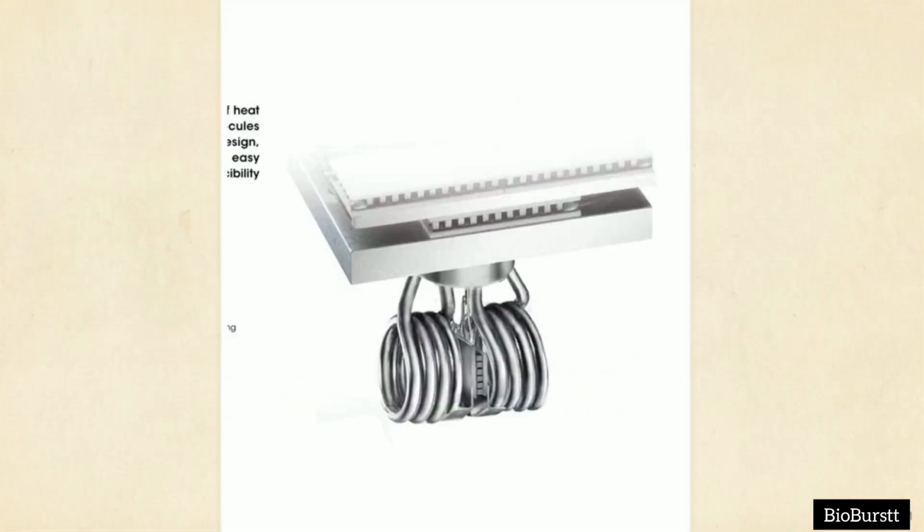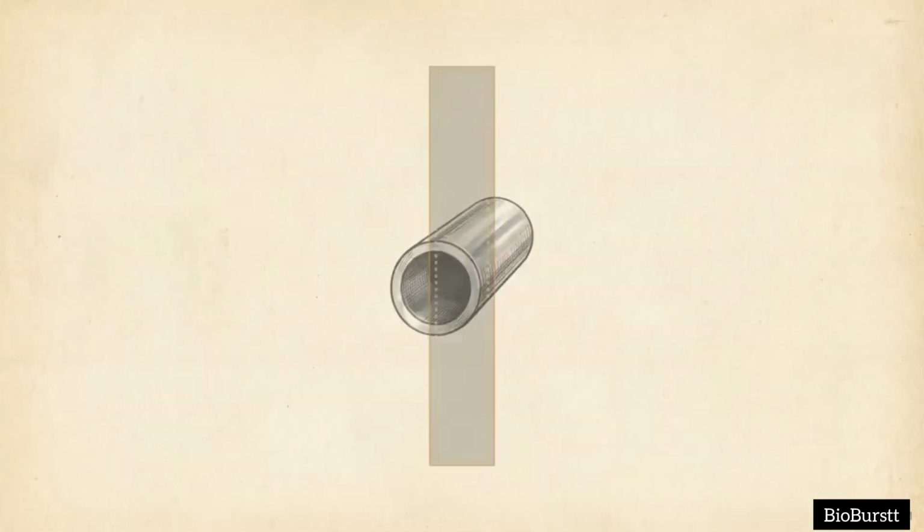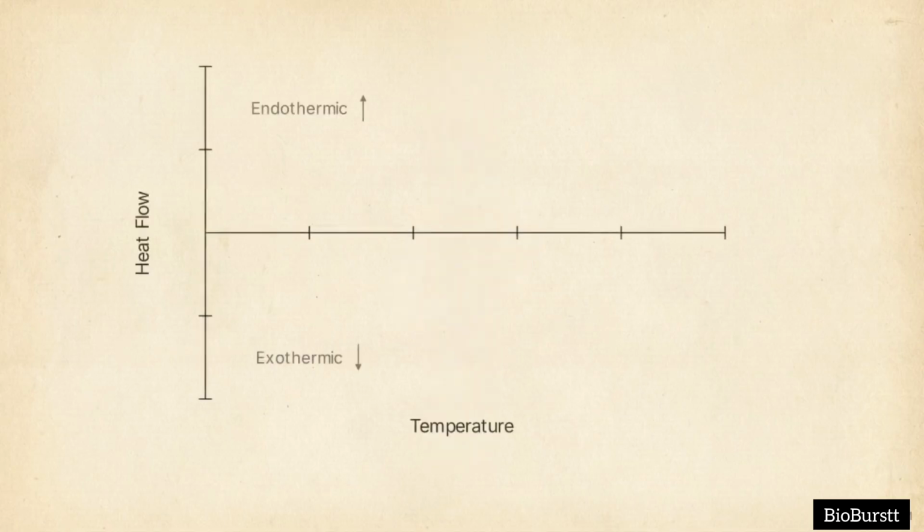This success is achieved through the geometry of these twin-coiled metal capillary tubes. By forcing the sample through this narrow, elongated path, the hardware maximizes the spatial distance between individual protein molecules. Because aggregation requires protein-to-protein collisions to occur, this spatial separation mathematically delays the clumping kinetics. The instrument is able to finish capturing the endothermic unfolding event before the exothermic signal of aggregation can drown it out.